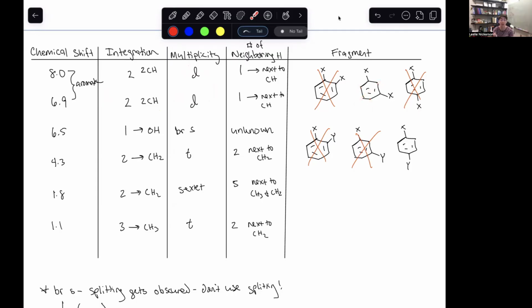So I would expect to have 3 peaks in my proton NMR for that meta substituted compound. If I'm looking at this one, that I only have this plane of symmetry, I've got 2 H's there that are the same and 2 H's there. There's only going to be the 2 proton peaks. It's only going to be splitting with each other. And we've got the 2 environments, okay?